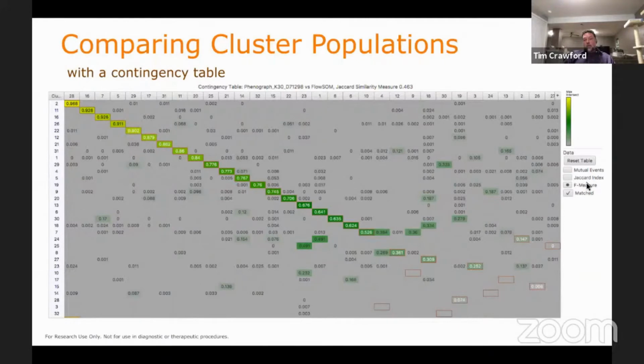You can all [run the] algorithm, and a lot don't actually use hard numbers, but there are a couple that use F measure statistics. And what you'll find is they have different math underlying. Maybe 60% of the clusters will be matched well, and then the rest of them kind of trail off. They also won't match your manually gated populations because these are unsupervised approaches.